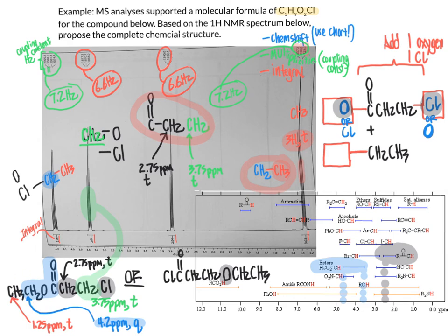Another thing to keep in mind is that when we are looking at organic molecules, functional groups are so well known for a reason. They're themes that occur all the time in organic molecules, be they naturally occurring organic molecules, be they synthetic molecules, whatever the case might be. And so anytime you can piece together common functional groups like an ester group into a molecule, that's very often going to be the correct way of going about things.